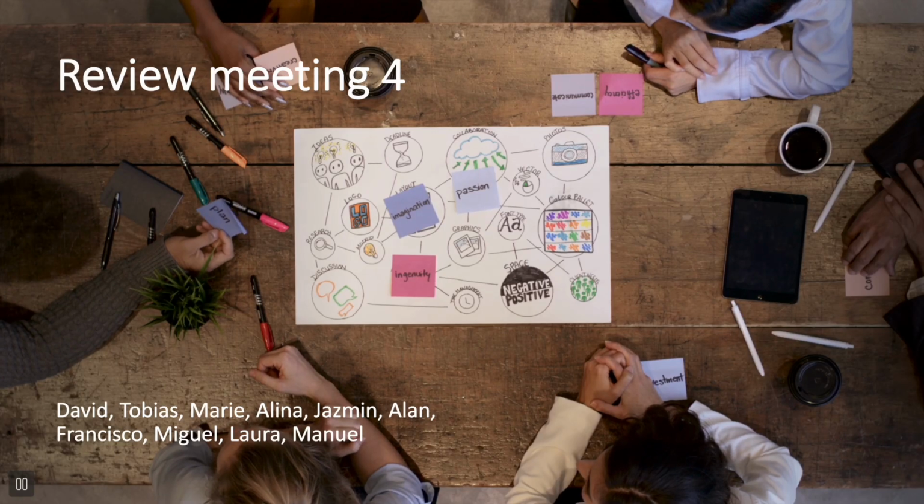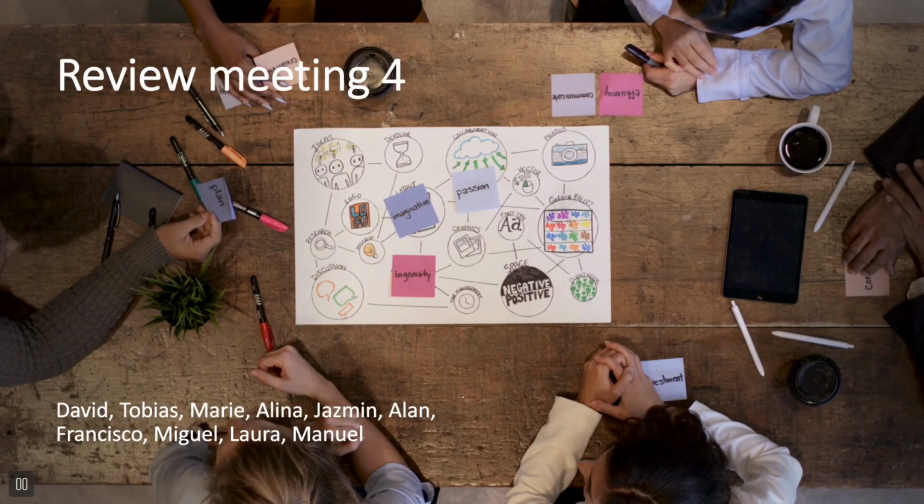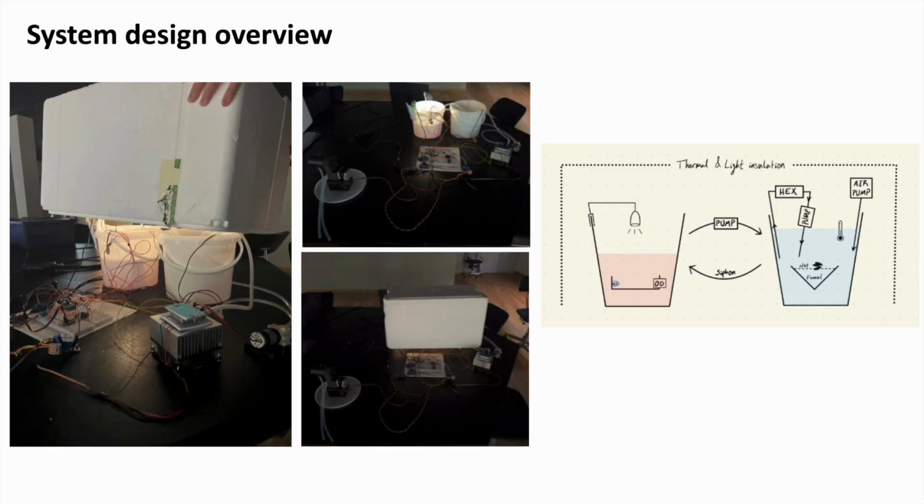For Review Meeting 4, we're excited to share with you our final project advancements. Our final experimental setup is shown above on the picture of the real-life setup as well as the system diagram on the right. The algae tank is the left bucket, equipped with a fixed light and an OD sensor.